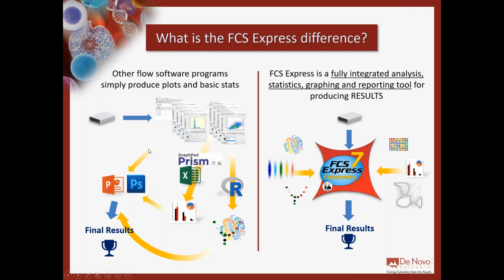Let's say, for example, when you want to present your data, when you want to create a picture for a publication, or a poster for a congress. Similar stuff when you want to deal with statistics. So you need to copy and paste or export to Excel, GraphPad, or some statistical software, create a chart, and then of course copy and paste that chart into your presentation or your poster.